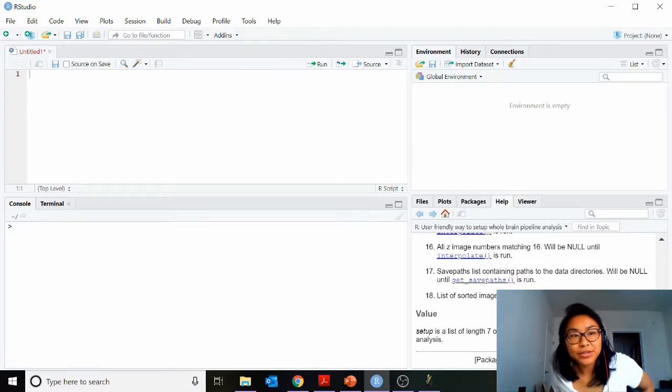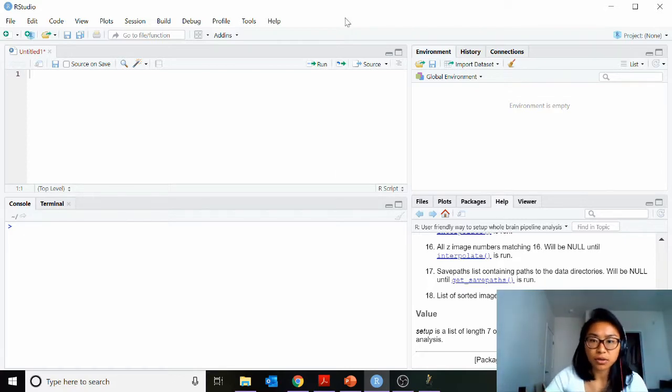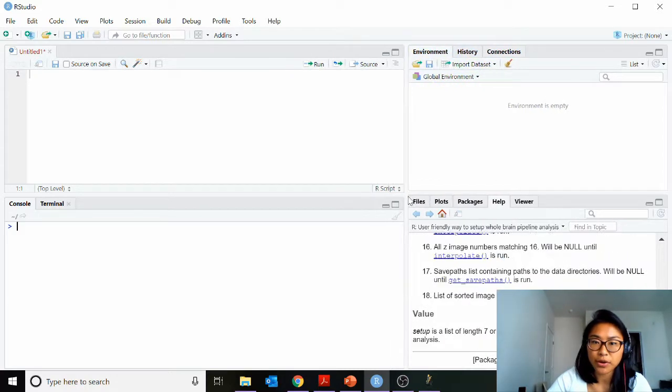Hi guys, okay, let's get started with the setup of the pipeline. Before we start, I'm just going to do a quick intro to the RStudio IDE.